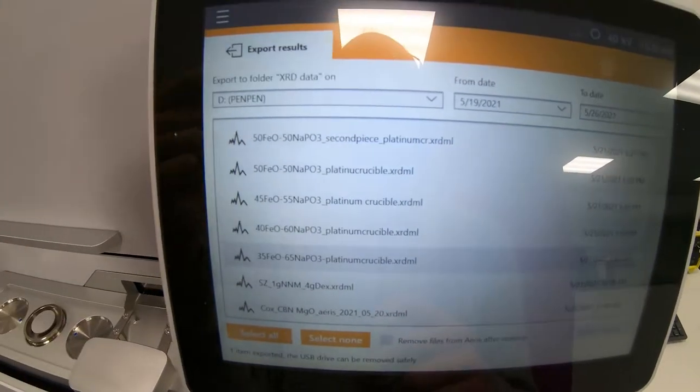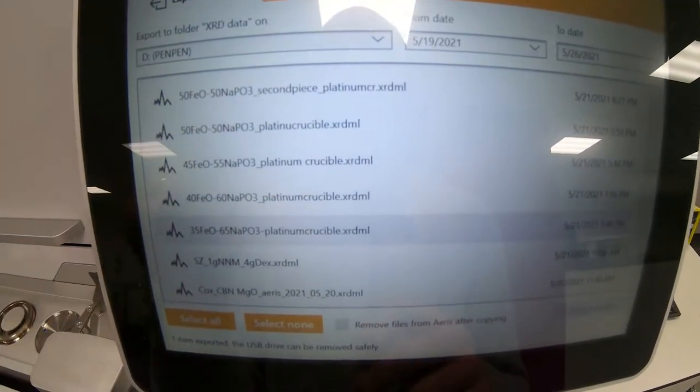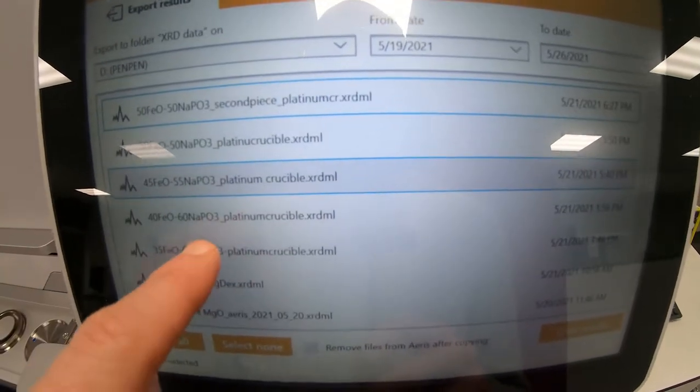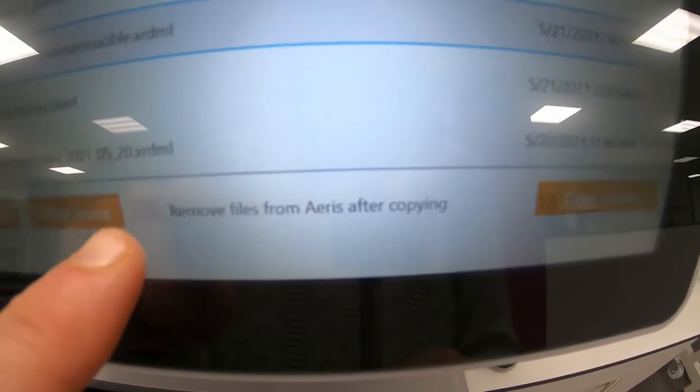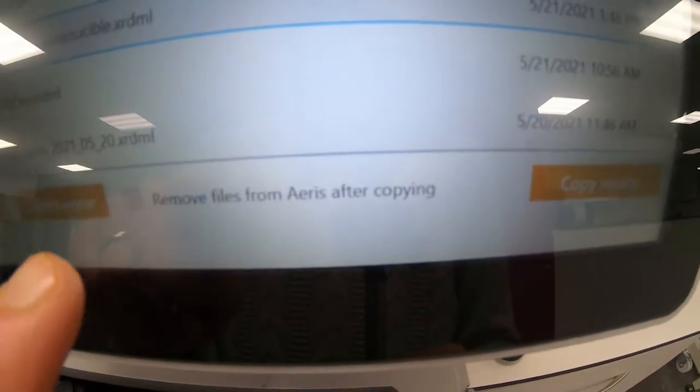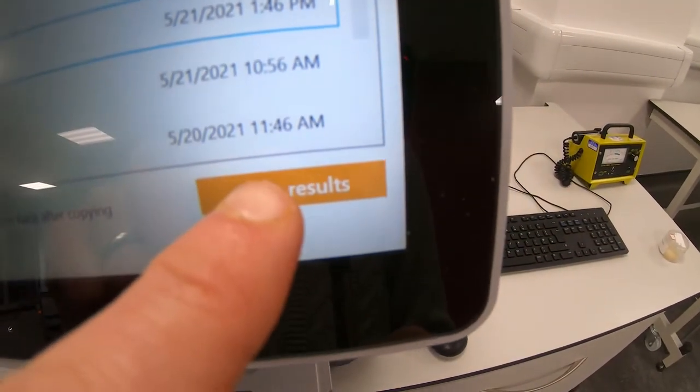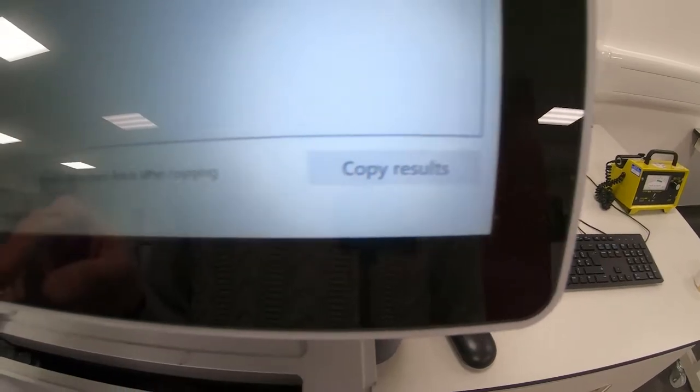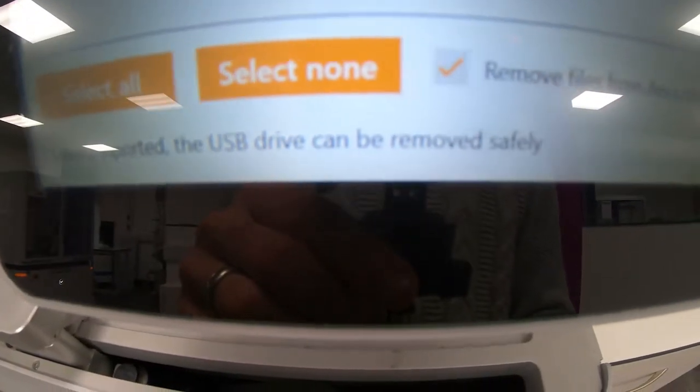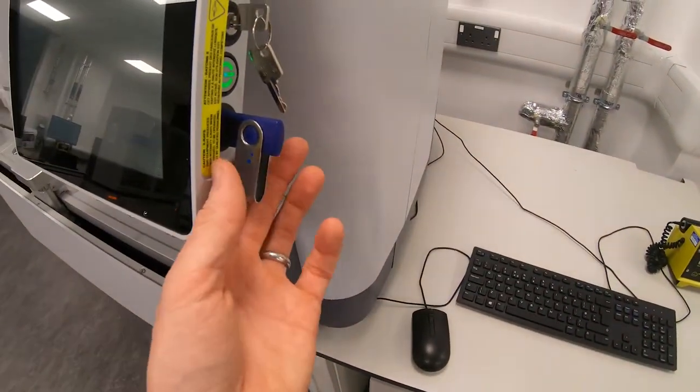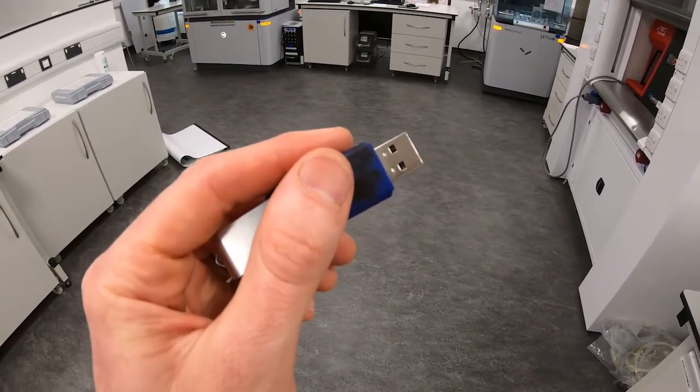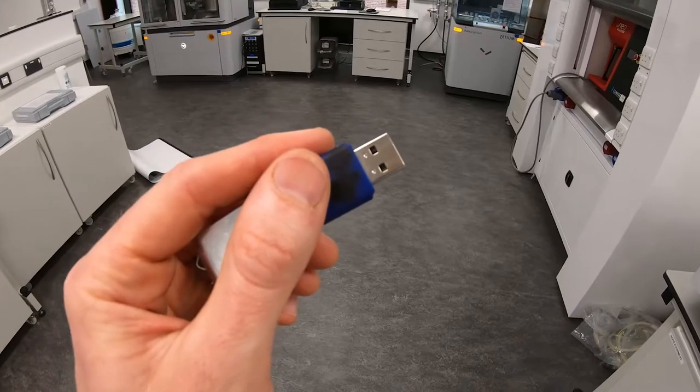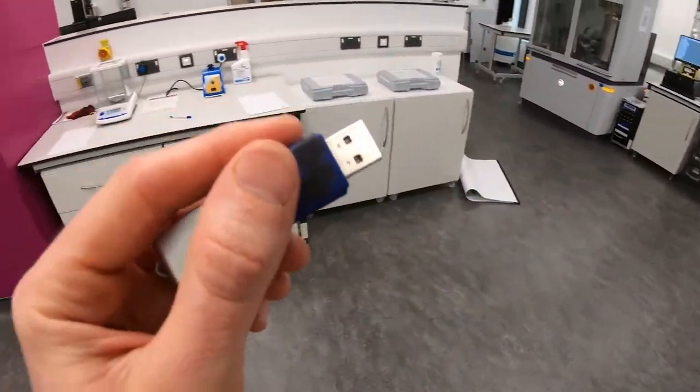You see, we can't select the silicon data that we've just experimented because it hasn't finished yet. But if I wanted to copy a certain result, I select them. These are the ones that I want. You press down here on copy results. You can also select here if you want to remove the files after copying them. Select copy results. It says there, three items have been exported. The USB drive can now be removed safely. So now I can take my files. On here when I load it up, there will be a folder that says XRD. When we open that up, we'll be able to collect our data. They are in XRDML format, which is the standard for all Panalytical instruments.